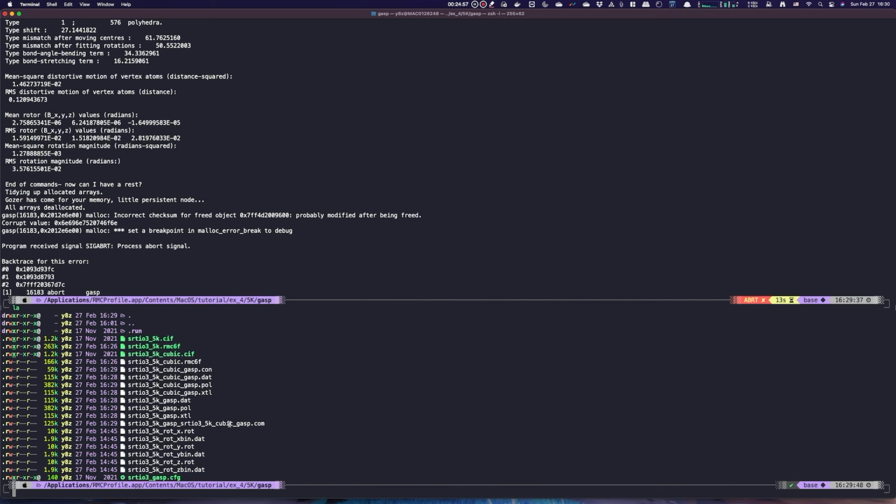But before we visualize the comparison results, we again need to transform that file into some other format so we can directly obtain the rotation and tilting angles to visualize. And to do that, we have again a bundled program called get_gasp_rotors.